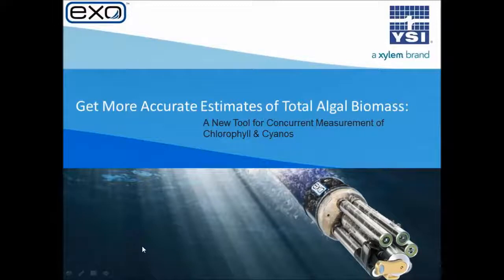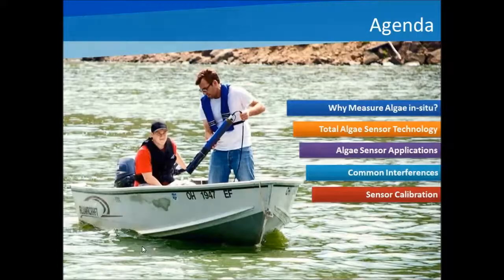Thank you for joining us, and today we're going to examine how combining measurements of several types of microalgae in water, such as chlorophyll and cyanobacteria, will provide more accurate estimates of total algae biomass. Our presentation will take about 35 minutes and we'll cover these topics. You'll learn about why it's important to measure algae and how it can be done in the field.